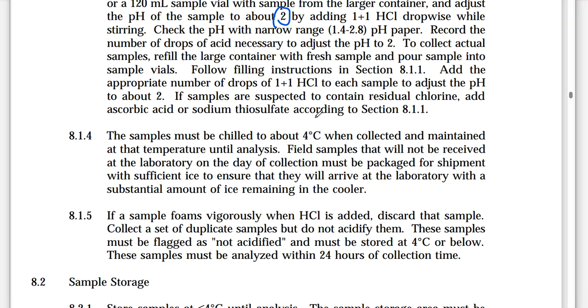So these are directions within an SOP. That SOP would be given to the field collector, and it would have very limited things on it, and it would only focus on the collection, preservation, and storage of those particular samples. That is it. That's all the field collector cares about. Why does the field collector want to know SOPs on all the lab directions? That's not their job for the day. That's not their responsibility for the day, so they don't need it.